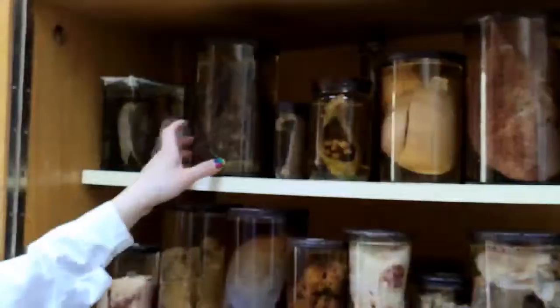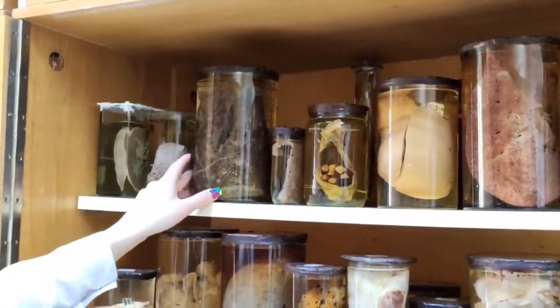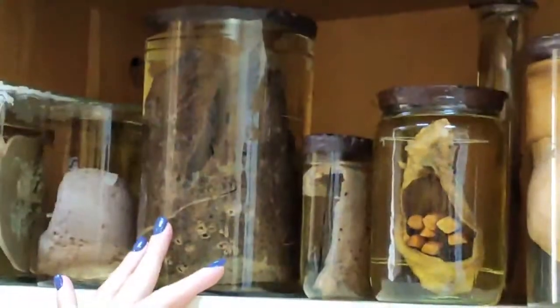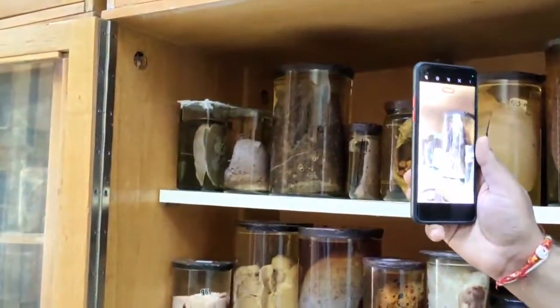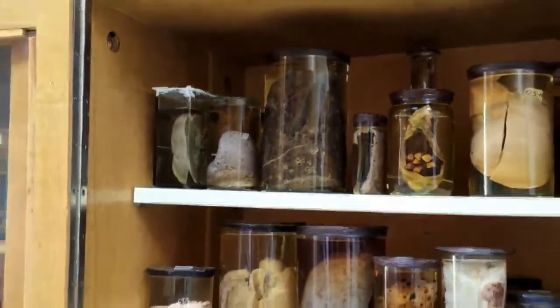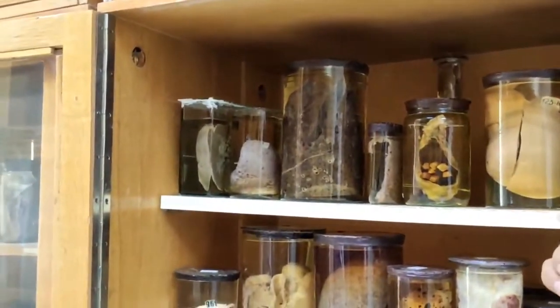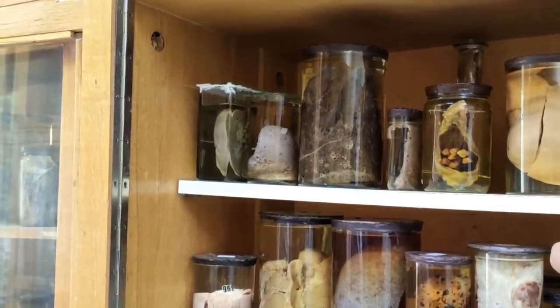One more condition. This is quite heavy, I will not lift it. No, it's better not to touch this because it's quite dangerous. You can maybe zoom in. This is brown induration of the lung. And you should remember this specimen from the first semester. We had it on the topic of disturbances of the blood flow.